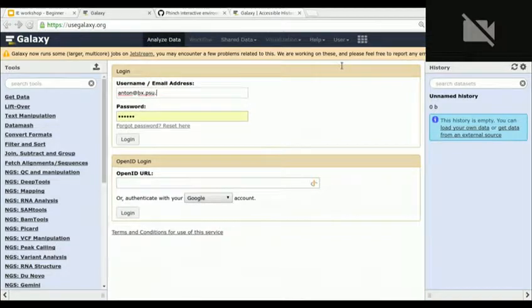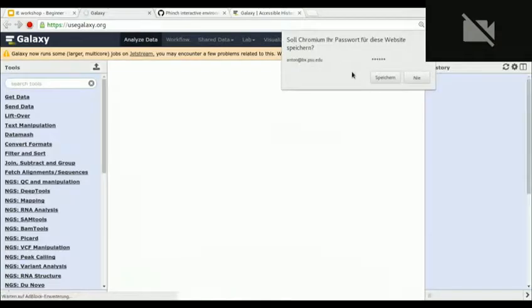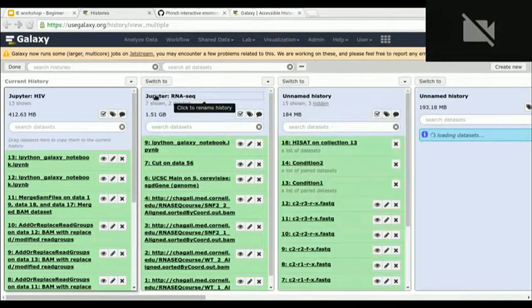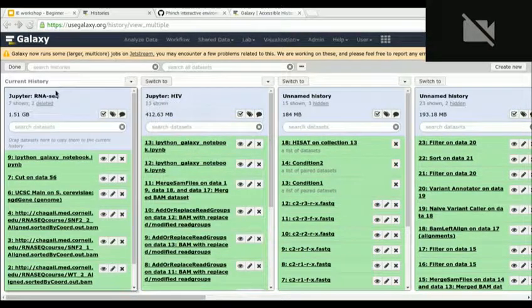I learned that the notebooks have been Python 2. There's no limitation, right? Yes, so Jupyter supports many different kernels. We have a few pre-installed kernels. We don't have all 26 or 27 that are available. But essentially, what I told you before, you can set up your own image. So if we are missing a kernel, just create your own image or contribute to our image, and we will rebuild it. We have a Haskell kernel.